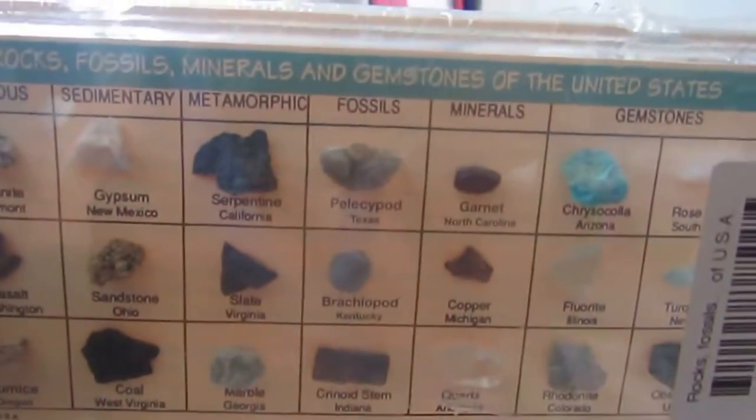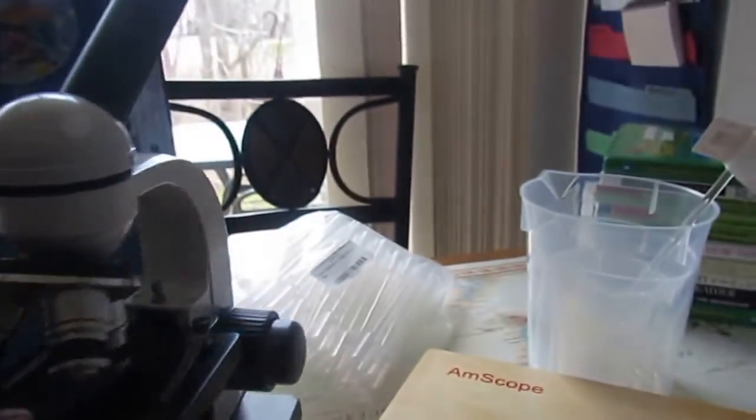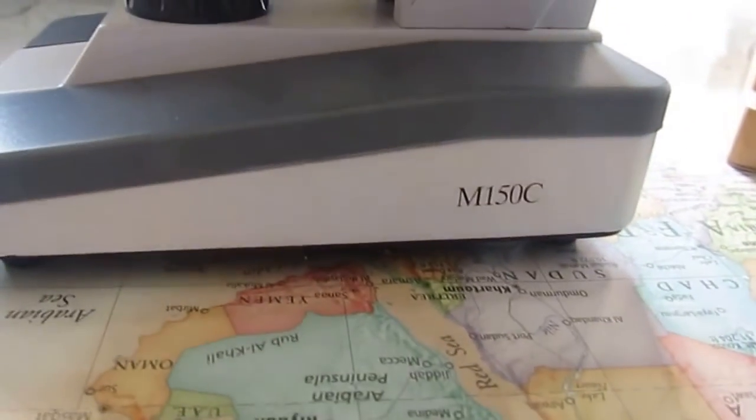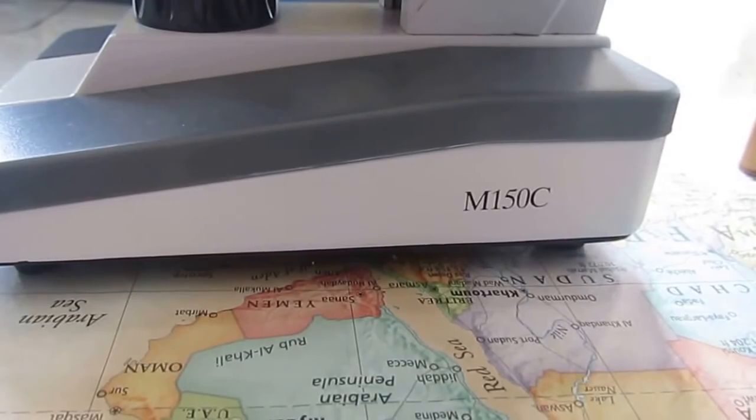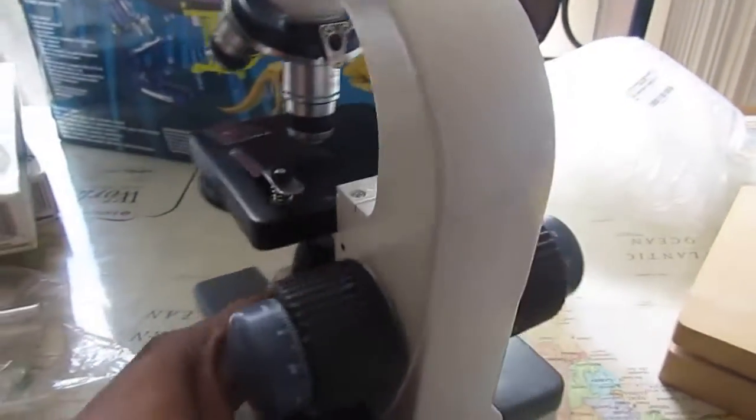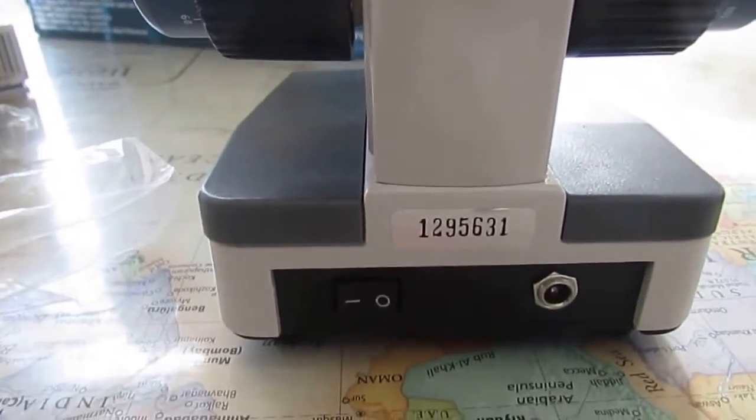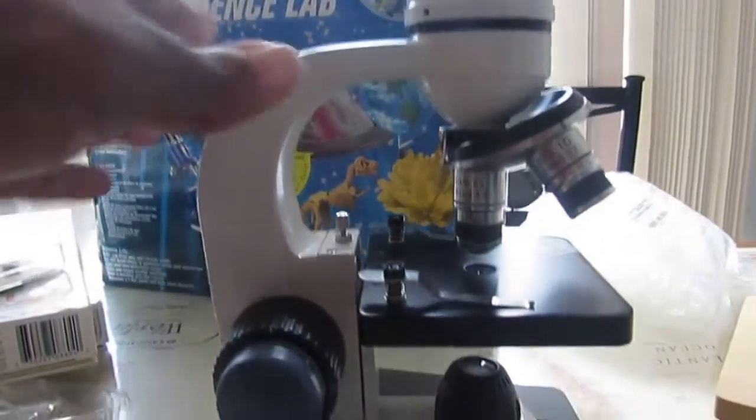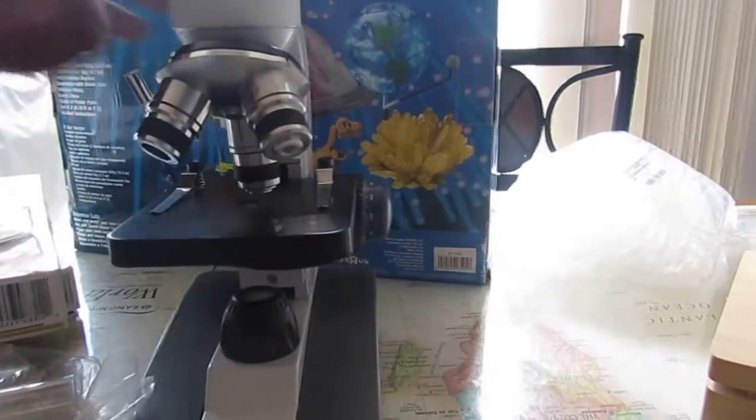I also have this rocks and minerals little set. Now I'm going to pull the microscope over a little more if you can see it. So this version, I guess, is the M150C. I like it. Works great for our family.